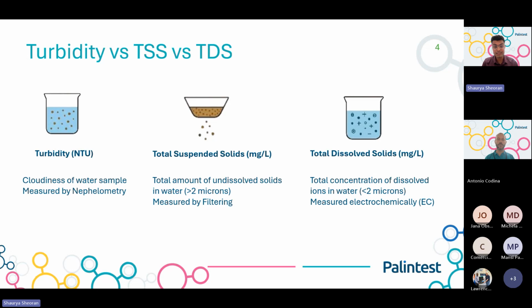Compare this to turbidity, which is an optical measurement. So in turbidity, what you're measuring is light passed through the water sample, and the suspended particles are scattering the light at 90 degrees. This principle is called nephelometry. Whereas in total suspended solids, you are actually measuring the weight of those particles. So they are correlated because if one increases, the other starts to increase.